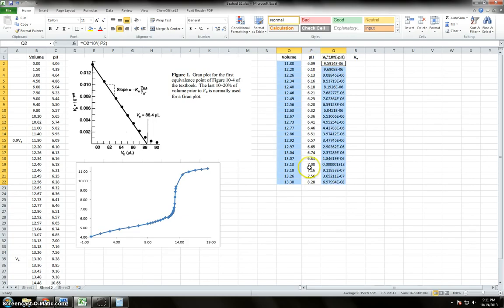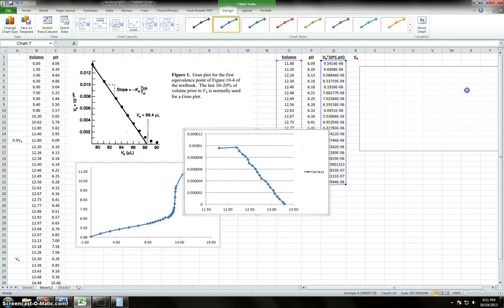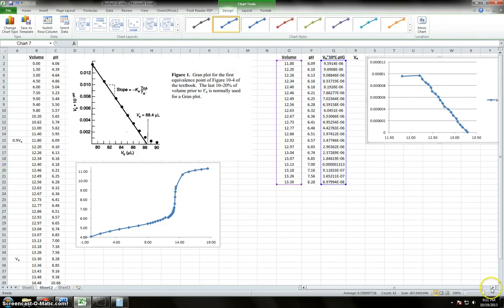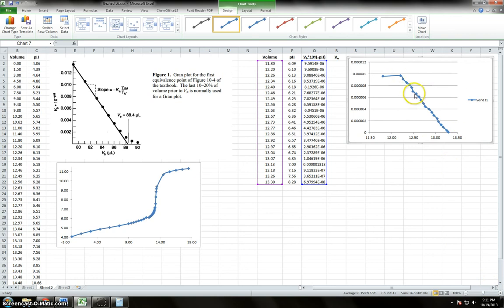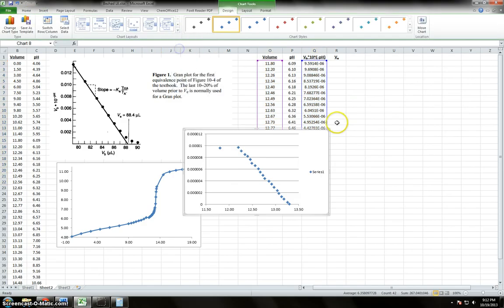So you can totally skip this area. And then I'm going to click insert, and instead of plotting it with smooth lines, you don't really want a continuous graph. You want independent values, because these connected dots isn't useful information. You just want the points being plotted.